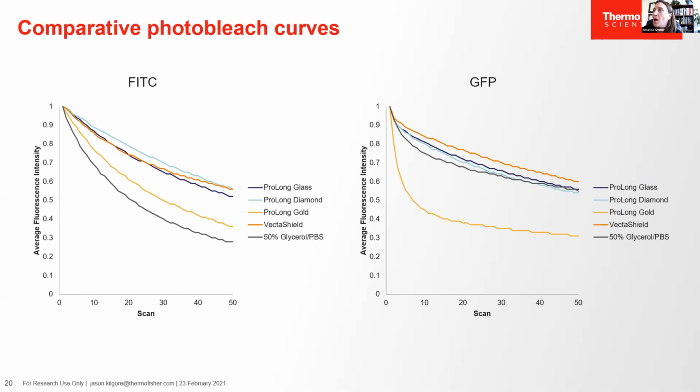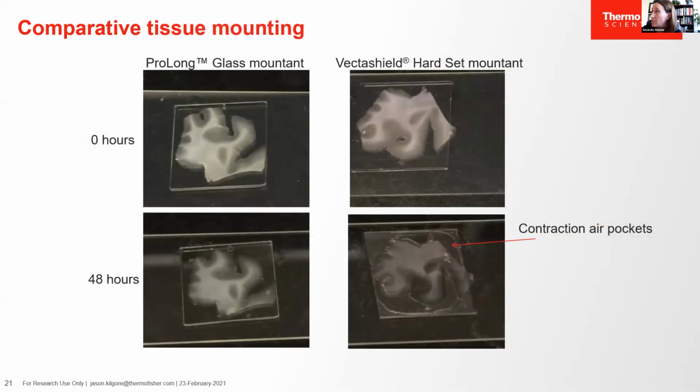Do you know of an example of a cell dye that can be stained a day before the fixation and still be bright? A day before fixation in live cells? Yes, but the problem is that with live cells, many of the labels that you do will be pumped out over time, like calcein, for instance, through active efflux of your dye. Most of the things that will bind covalently to the cells will affect cell function, with some exceptions.